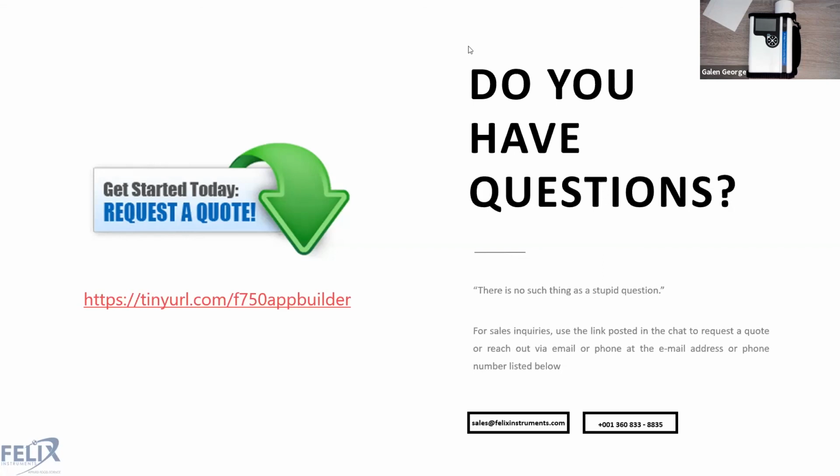So let me go and check really quick in the chat. It's from Pablo. Okay, so there was a question in the chat at 9:04. Yep, I see it. Okay. So Pablo, could this meter be used to determine the content of vitamin C in the fruit?